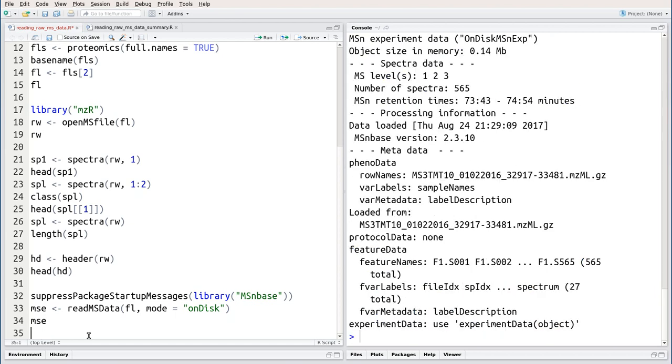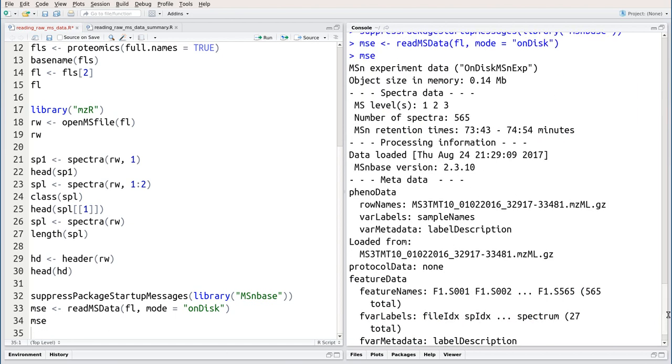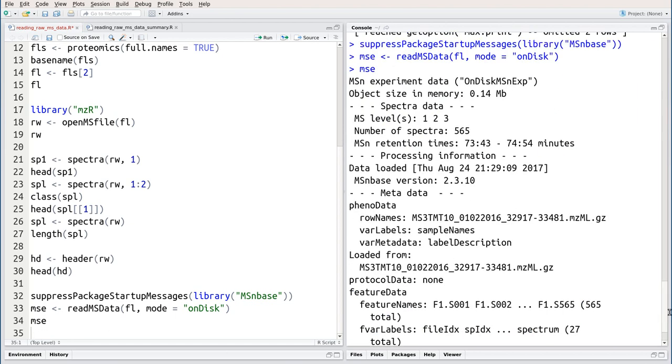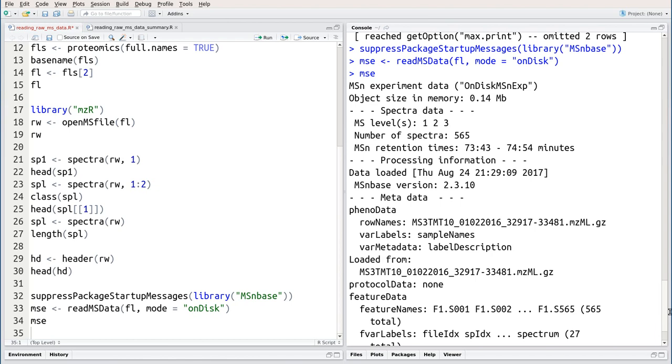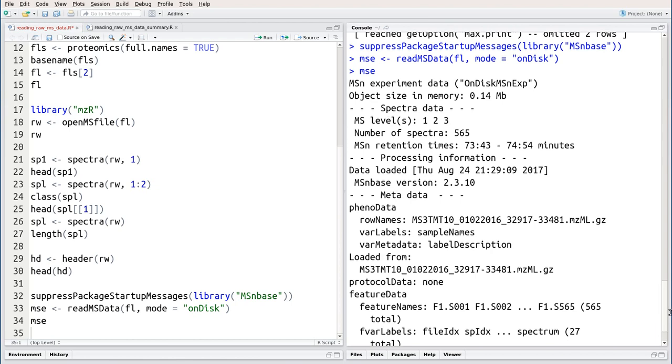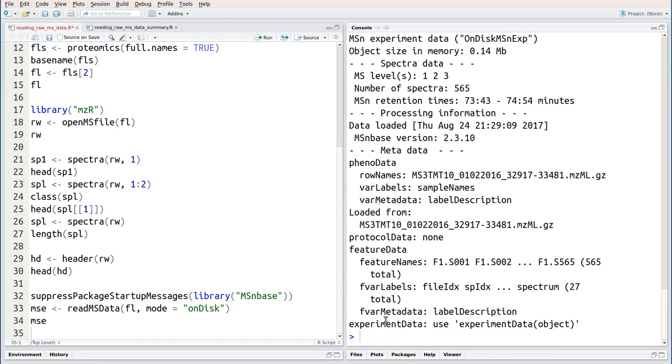So here we have now created a new type of object, which is an MSN experiment data object, that encapsulates all the information that is needed about this MSN raw data file.